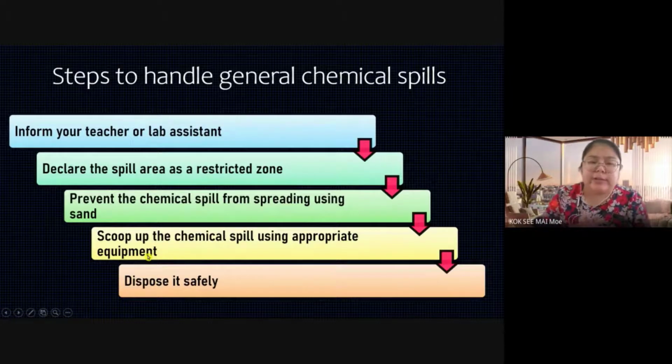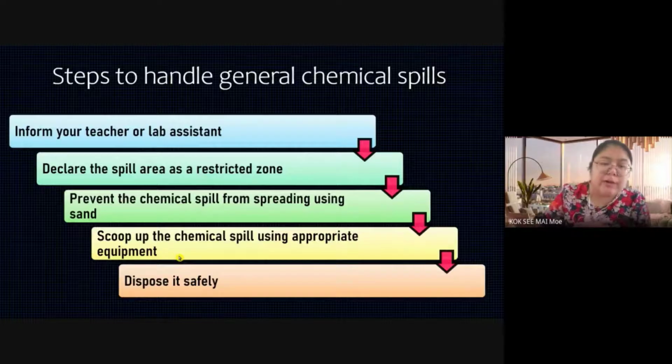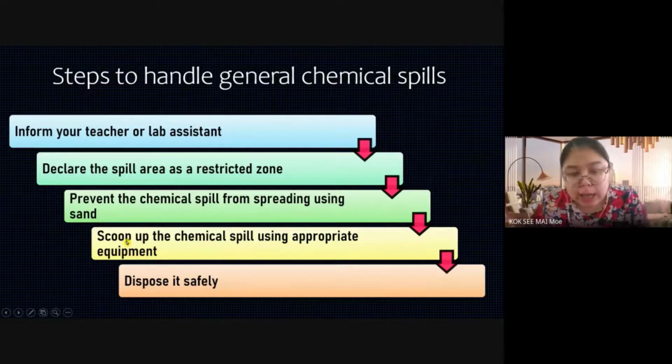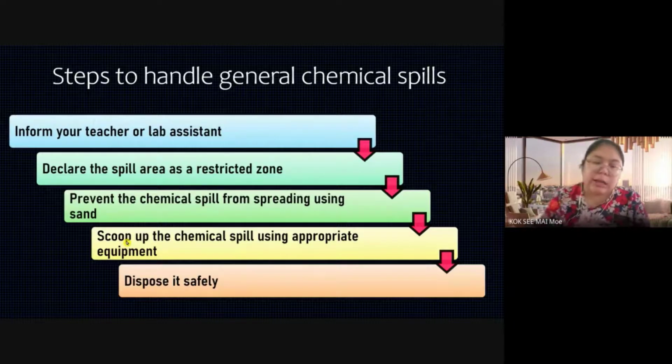Okay, then number 4, they say scoop up the chemical spill using the appropriate equipment. Okay, if you can take it out, then you scoop it. Okay, after that, dispose of it safely. But this scoop is normally not used lah. It's like a bomb, dangerous, so you need to stay far away. Dispose of it safely.